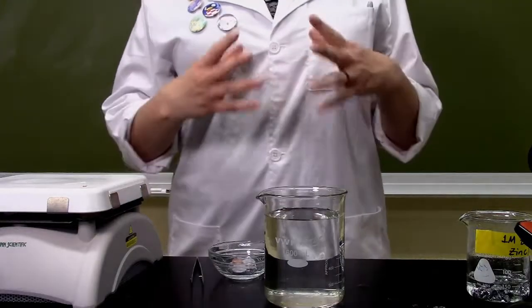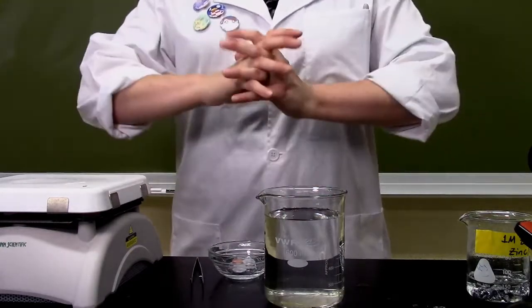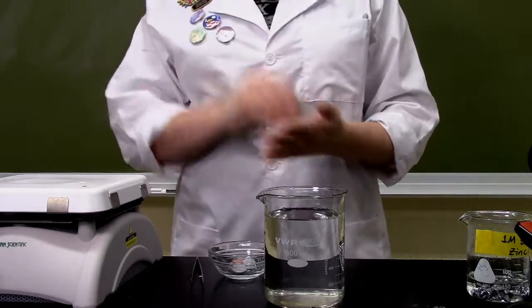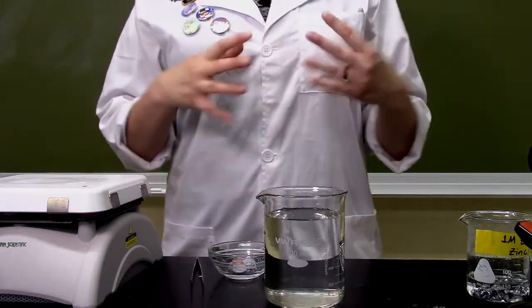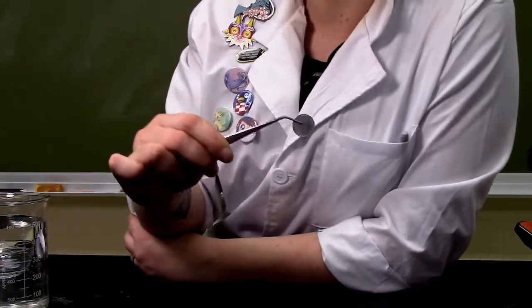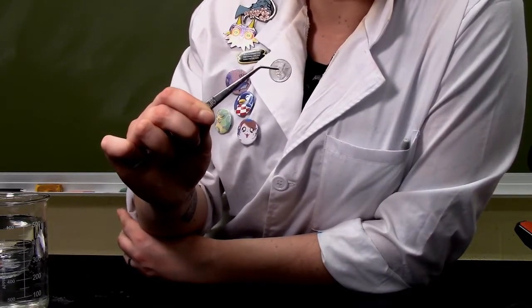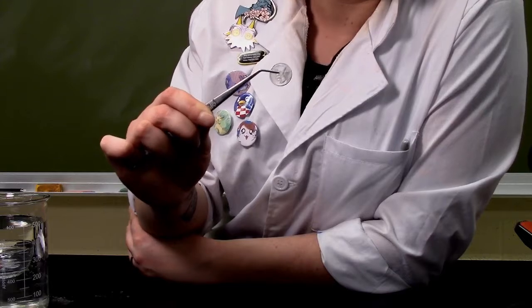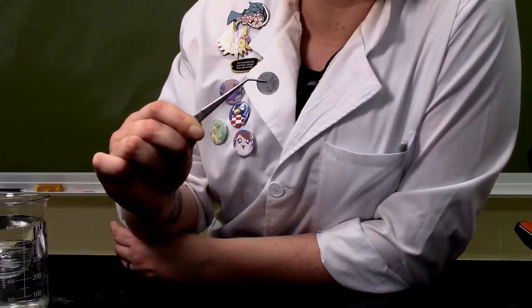Bunsen burner. And the Bunsen burner is fire, so I want to make sure that everything on my bench is where I want it to be, safely spaced apart from the Bunsen burner, and overall just tidied up. In this last part, we will be taking one of our silver pennies and turning it into gold. But as y'all know, we can't actually turn it into gold.